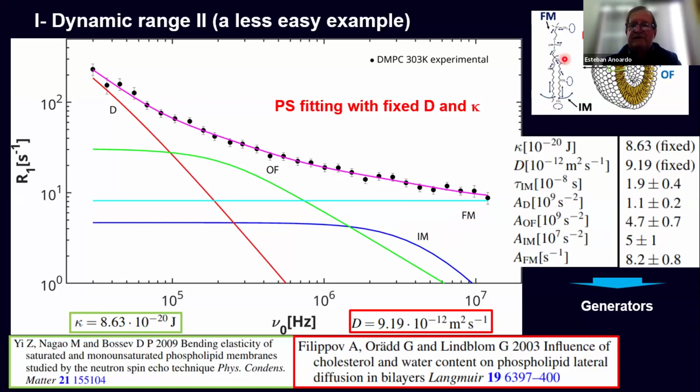Here in the picture, we can see fast motions are present in some vibrations connecting different atoms, part of the molecule, while the slower intramolecular motions mean some fluctuation of the chains, etc. So of course there are some rotations also involved there.